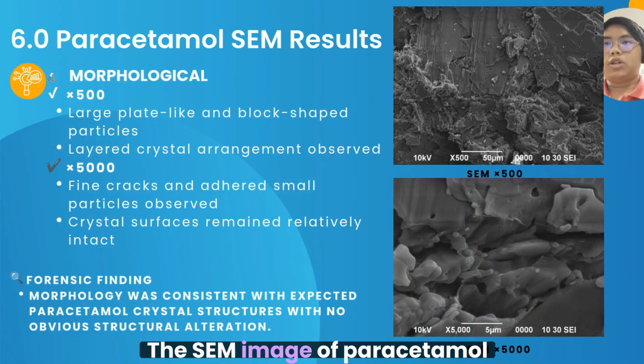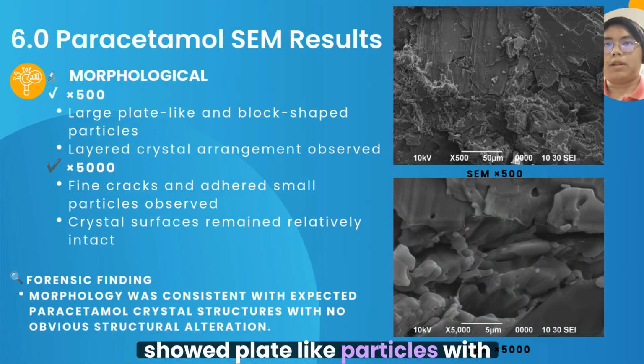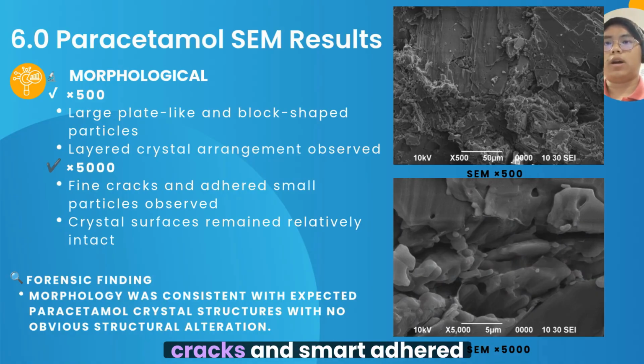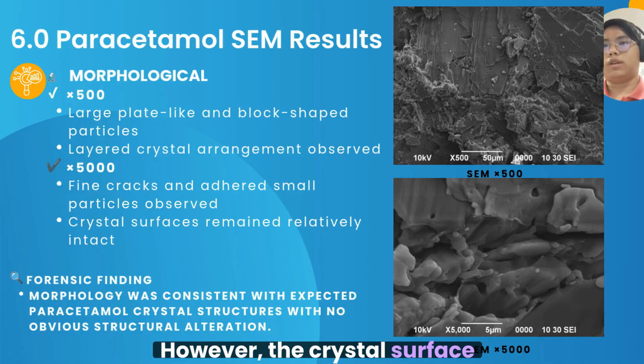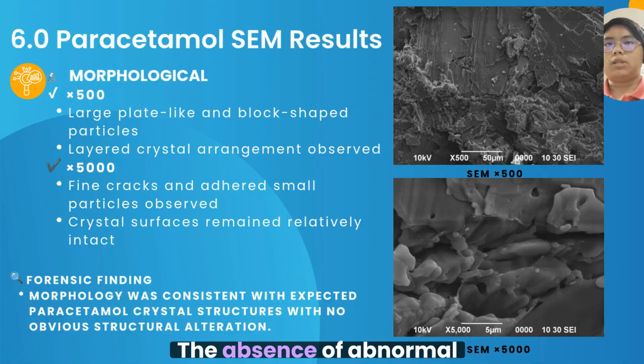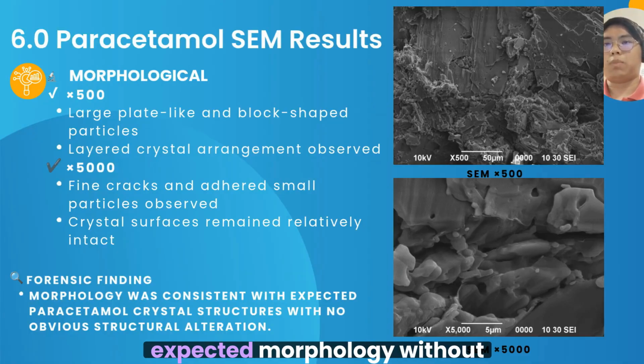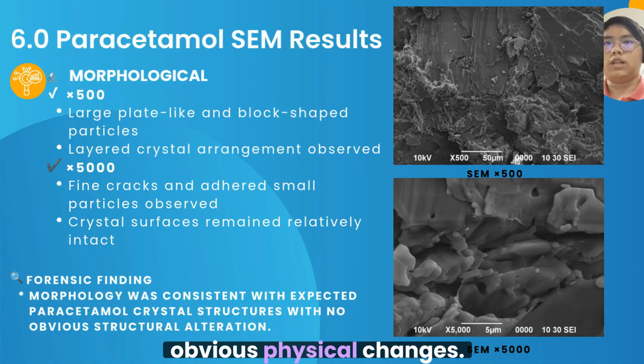The SEM image of paracetamol showed plate-like particles with layered crystal arrangement. At higher magnification, fine cracks and small adhered particles become visible. However, the crystal surface remained relatively intact. The absence of abnormal structure features suggests that the sample maintained its expected morphology without obvious physical changes.